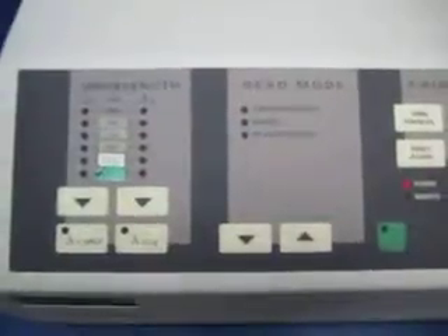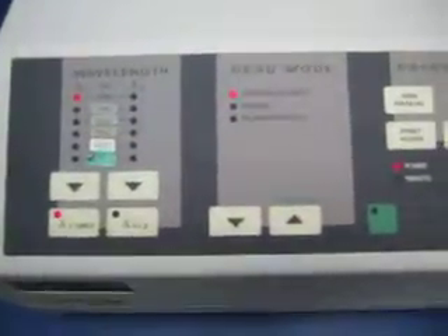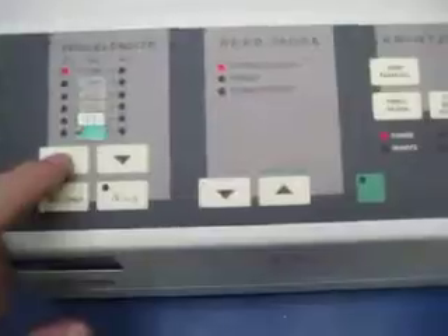This is our Emax micro plate reader. We don't know a whole lot about it, but we're going to show you what we were able to get it to do.